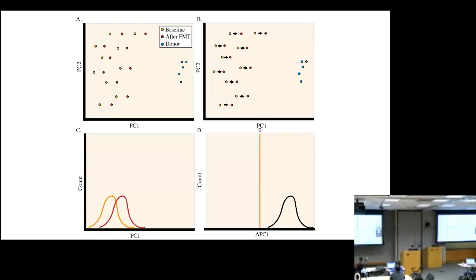But when we're looking at longitudinal data, it's so easy to look at this clustering, like we saw in our PCoA, and say, okay, that doesn't cluster independently, or doesn't cluster significantly differently. We can look at this kind of distribution that I drew, and we can see that they fully overlap, because that's what the cluster looks like, right? They just fully overlap.